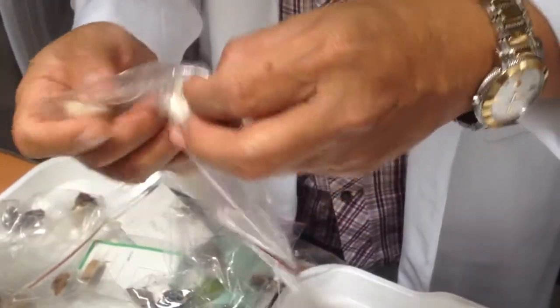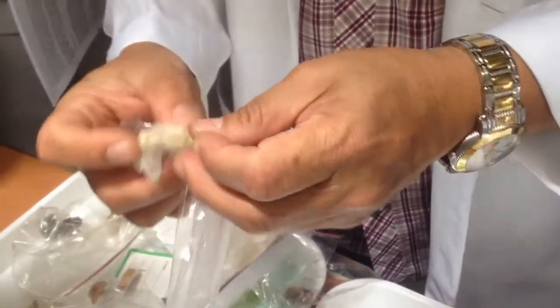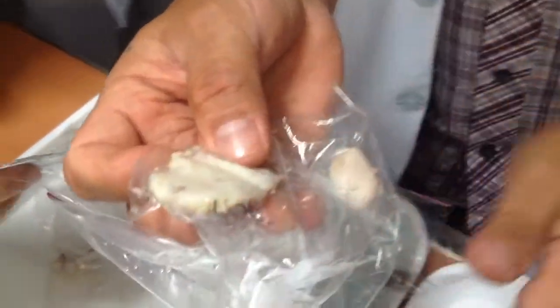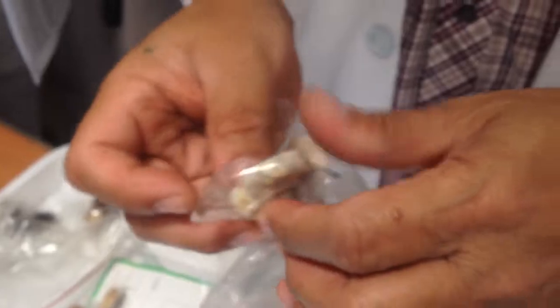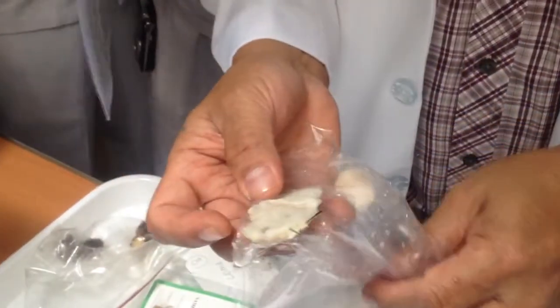And characteristically shows what we classically describe as a lobulated cut surface. So if you will review your gross of the pancreas, this is similar to the pancreas on cut section. So lobulated cut section.